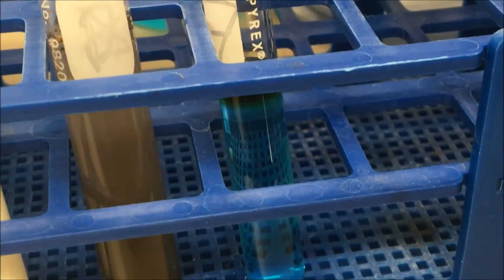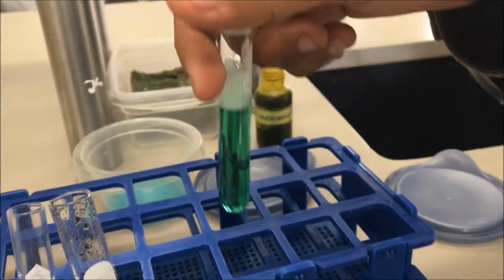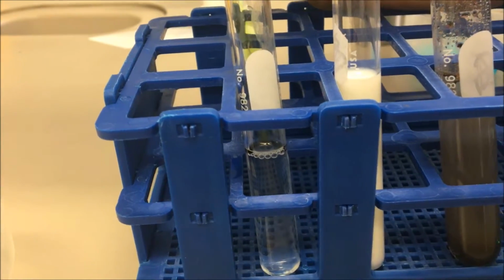After adding the 4 drops of the pH universal indicator, you will see that each substance's color will change. However, you must observe whether the original color of the substance affects the final result. In this case, you may need to add more drops.